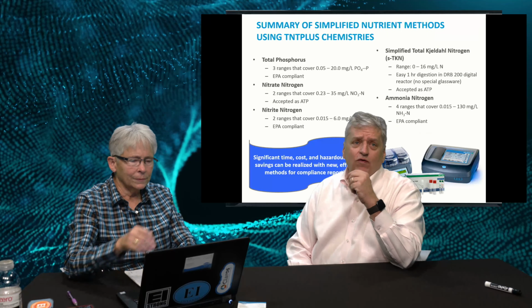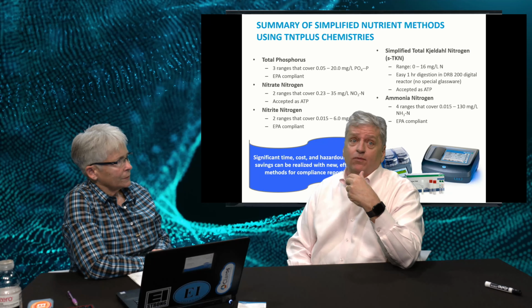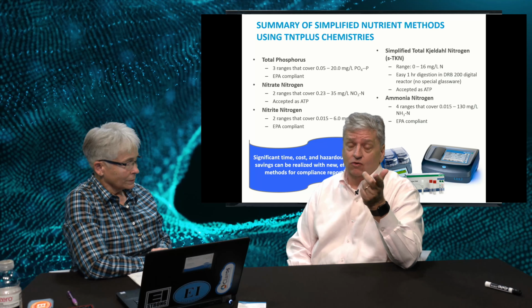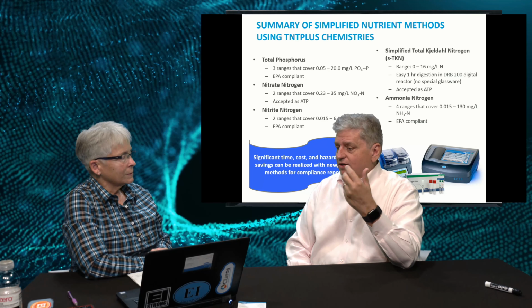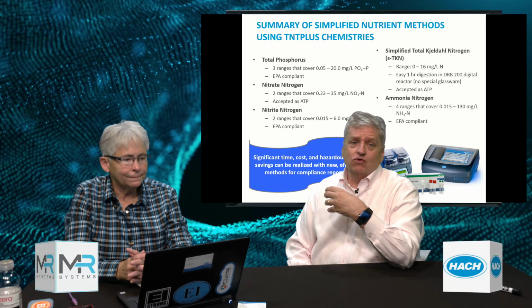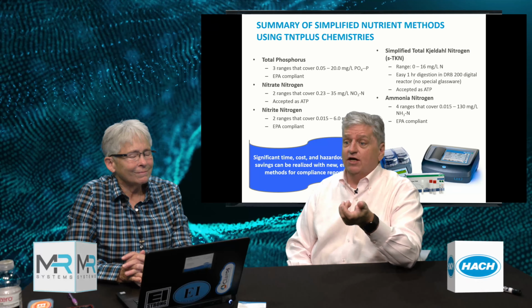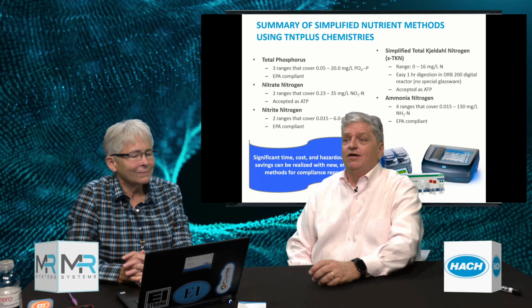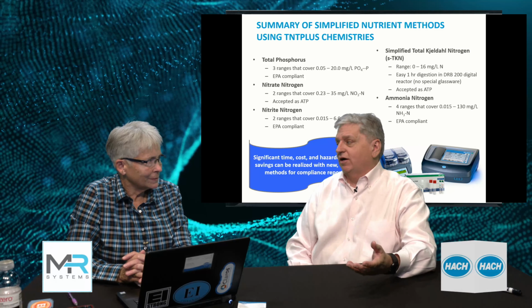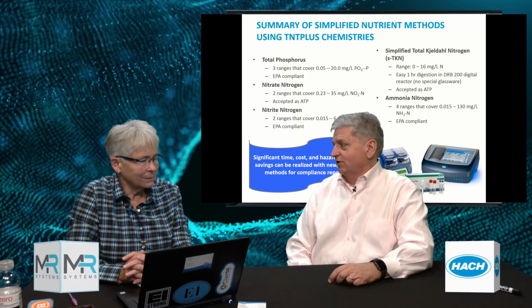And really what we found is that the more modern plants are putting in some of these online analyzers and correlating them to the lab data, because it gives us real information of what we're trying to control. Historically, we've had to use derivatives of nitrification and denitrification, mainly dissolved oxygen. Ammonia is a much better value to correlate whether your nitrification is complete.